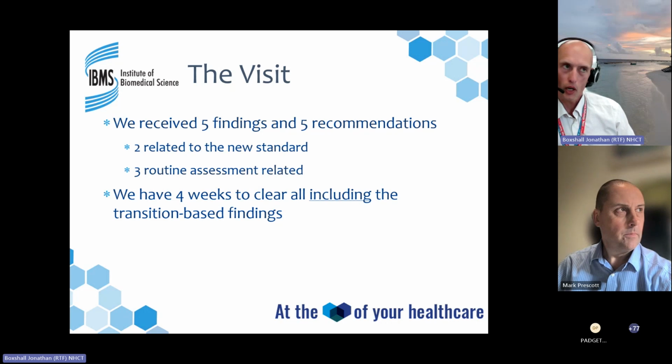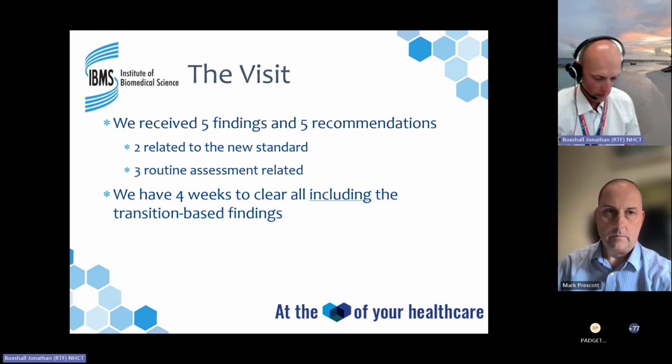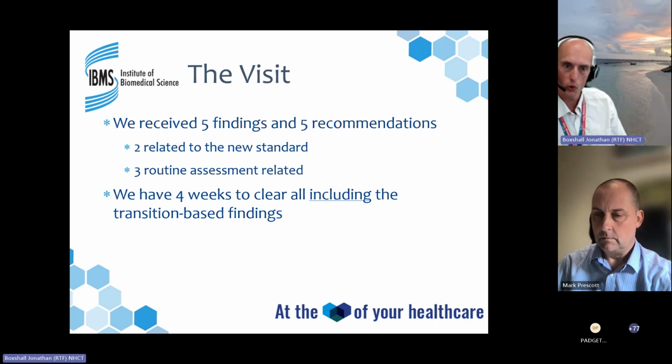So you've got to bear in mind, it's almost like the hidden work when you raise and then find something, and you go, what else am I going to have to do with it? So just to say, usually when I'm rejecting evidence supplied, it's not actually for the finding, it's more the fact that they haven't fully considered cause and extent.